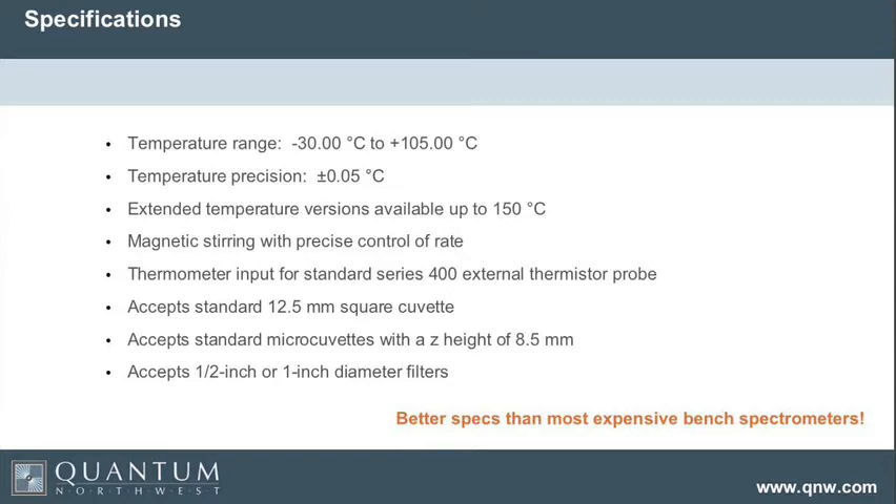It takes a standard 12.5 millimeter square cuvette — that's your standard cuvette, though they also make micro cuvettes and so forth. It uses a Z-height of 8.5 millimeters, and as mentioned, it will hold either half-inch or one-inch round filters.